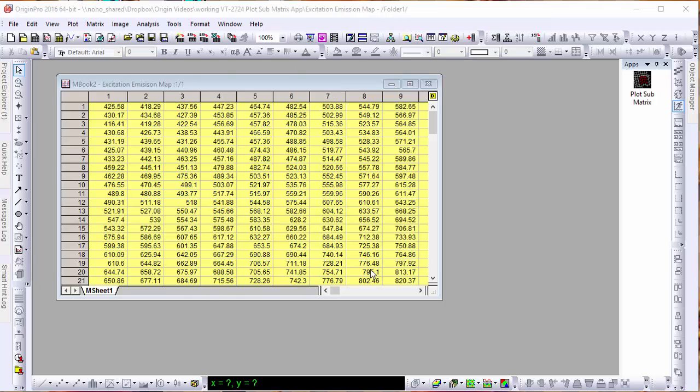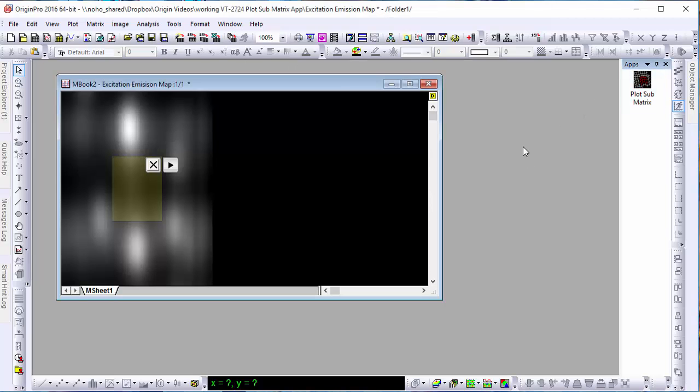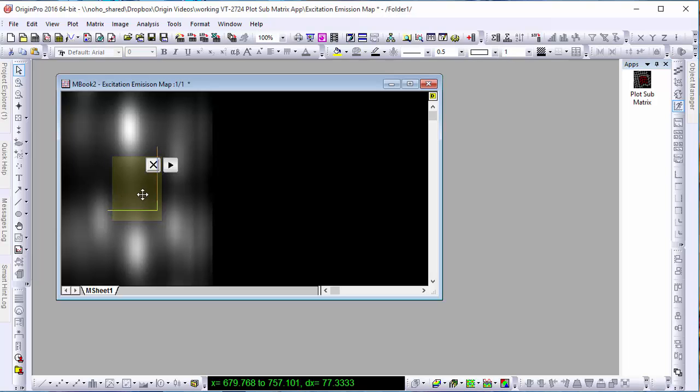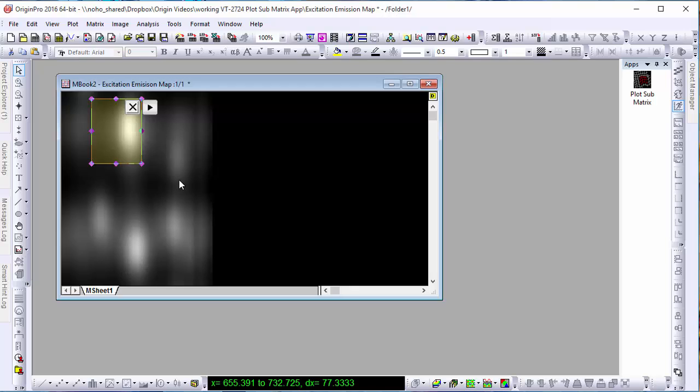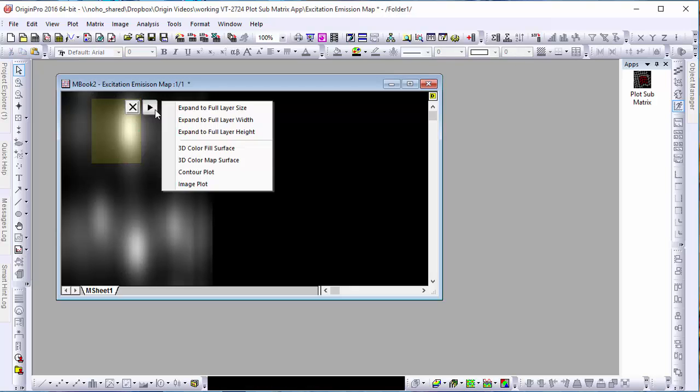With this window active, let's select the Plot Submatrix icon in the Apps Gallery. Our data is now displayed visually with varying shades corresponding to the values of each cell. You'll also notice a region of interest box has been superimposed on this image.